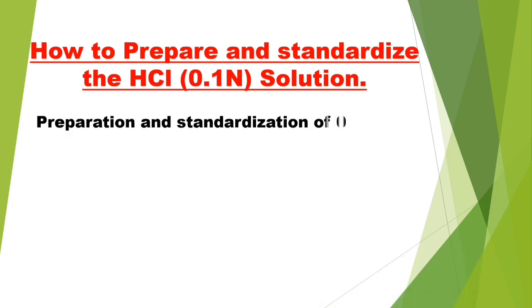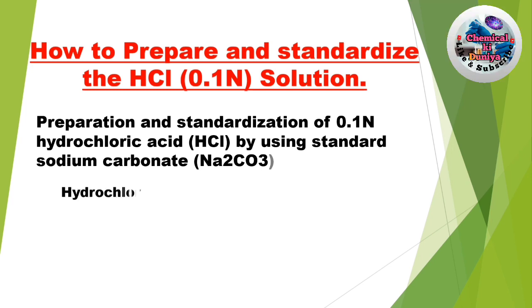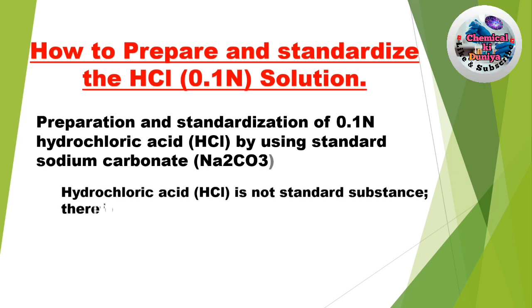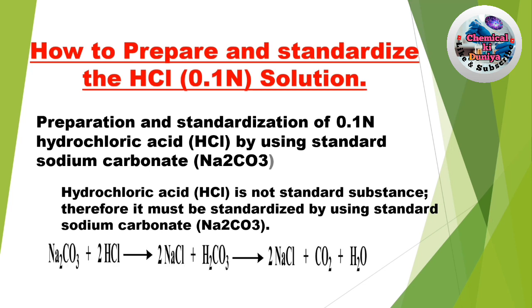Let's start the topic. Preparation and standardization of 0.1 normal hydrochloric acid by using standard sodium carbonate. Hydrochloric acid is not a standard substance, therefore it must be standardized by using standard sodium carbonate. Sodium carbonate reacts with HCl to give NaCl and carbonic acid.